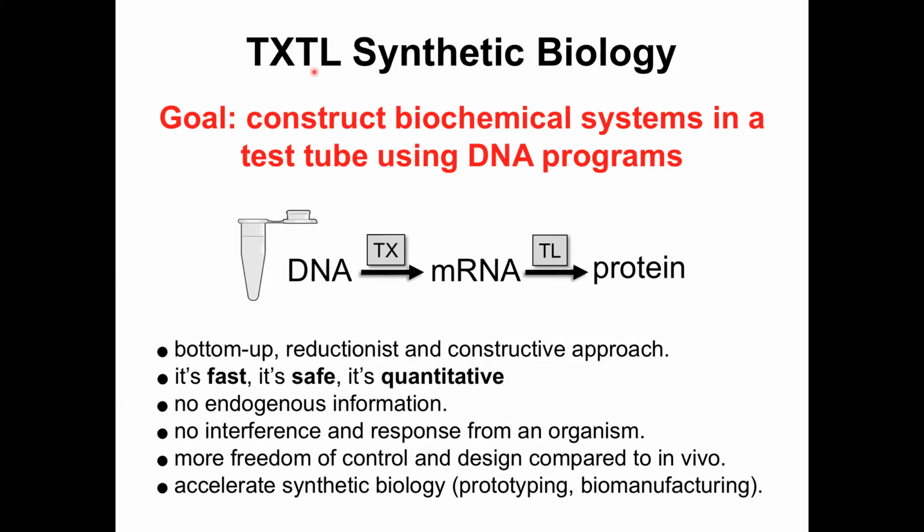So in cell-free synthetic biology, the major goal is to construct a biochemical system in a test tube using DNA programs, like you see with the image in the center here. And there are many advantages with that, and also disadvantages. One of the major advantages is that it's bottom-up, reductionist, and constructive. The TXTL system is fast, it is safe.